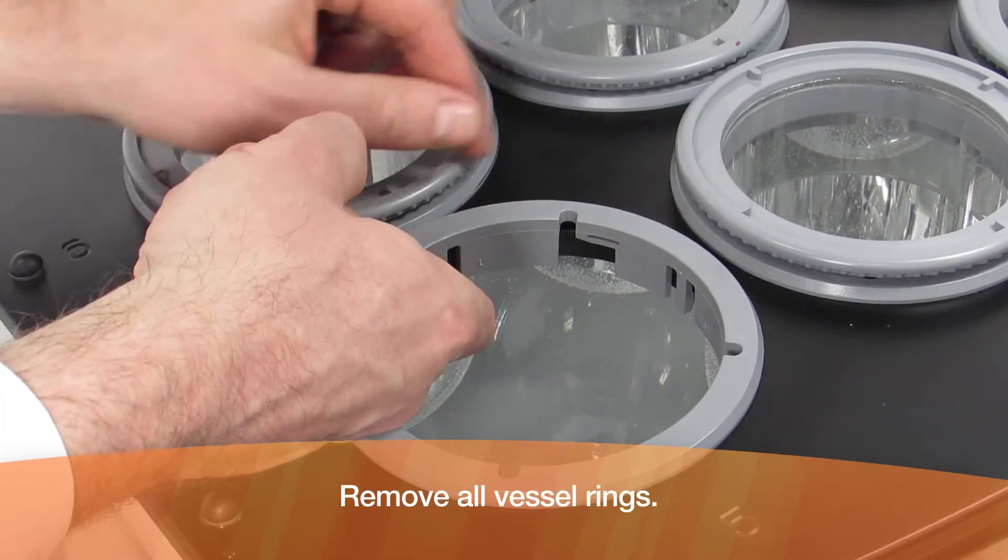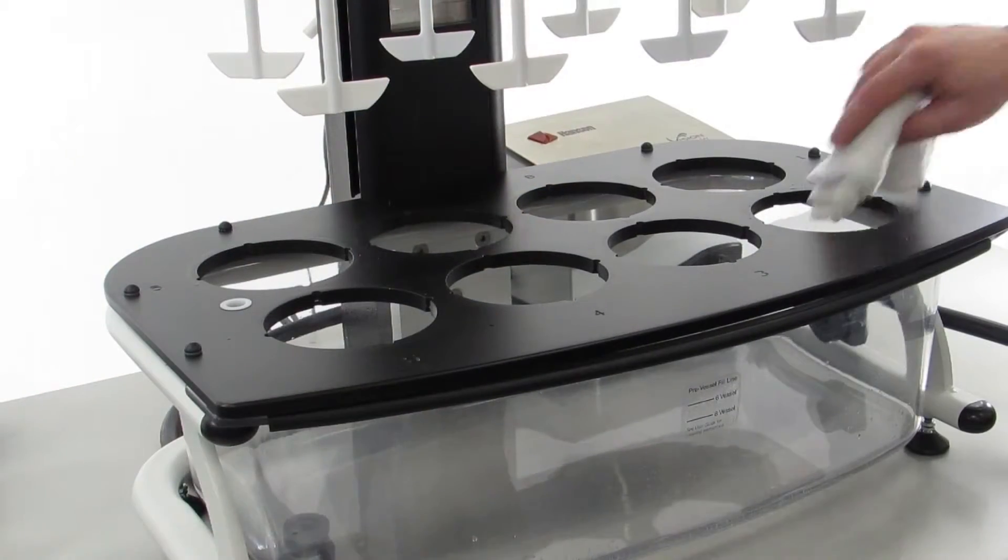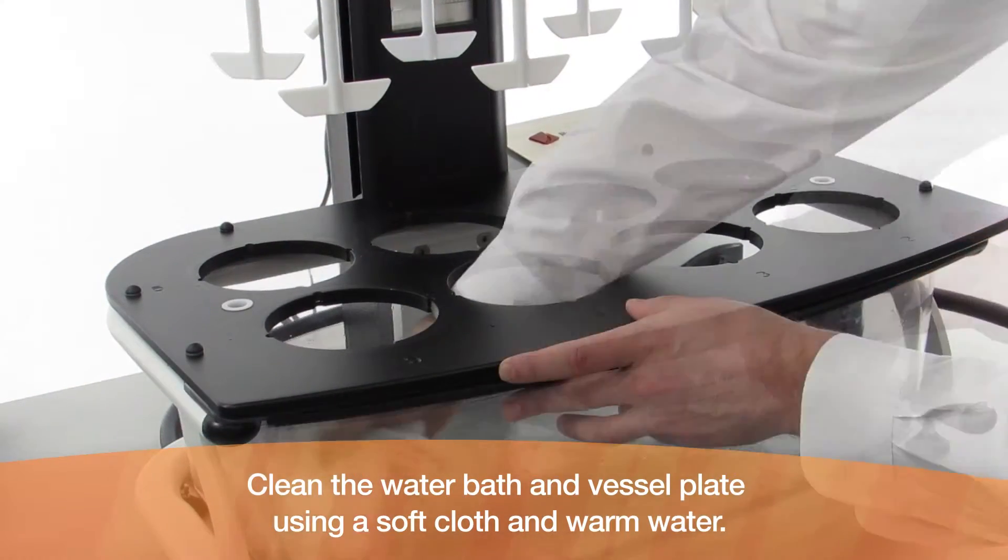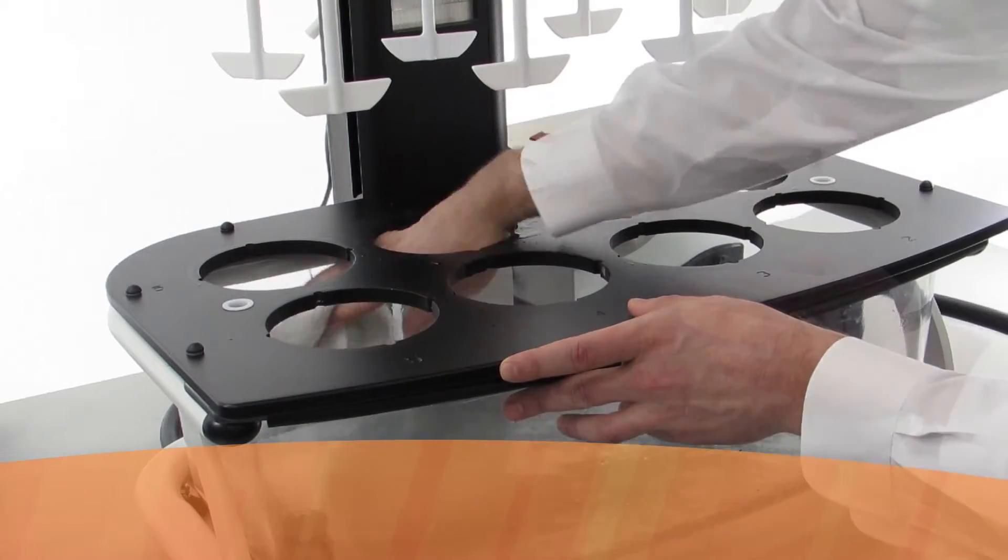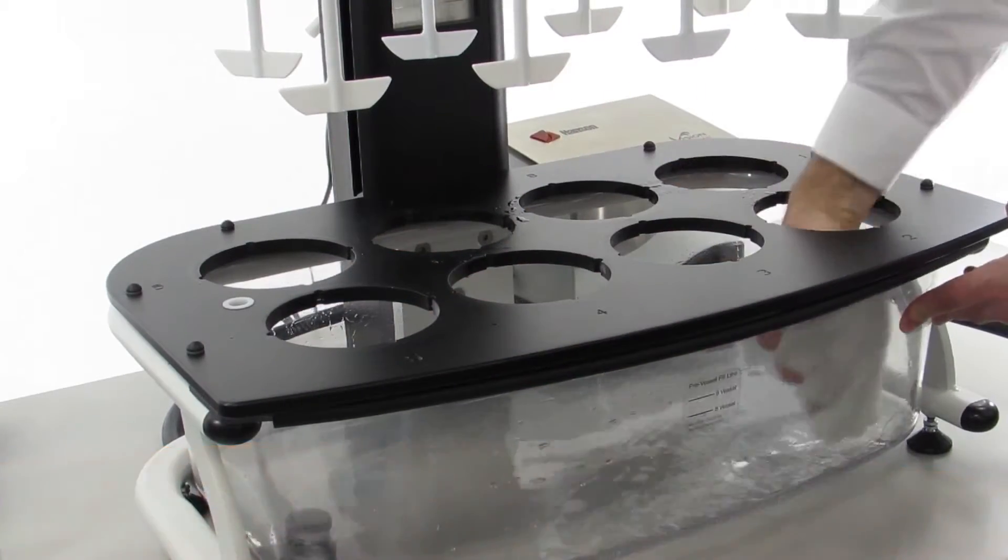Remove all vessel rings. Clean the water bath and vessel plate using a soft cloth and warm water. Do not use chemicals or abrasives of any kind.